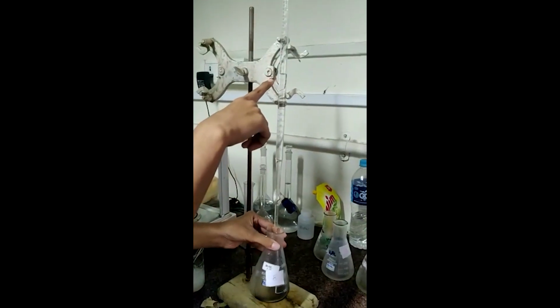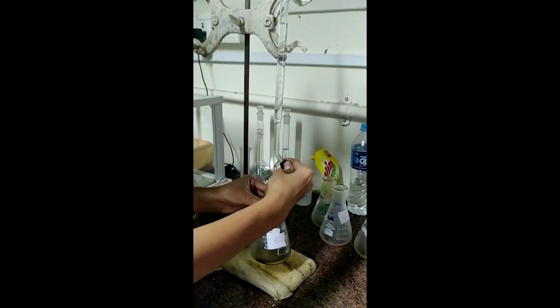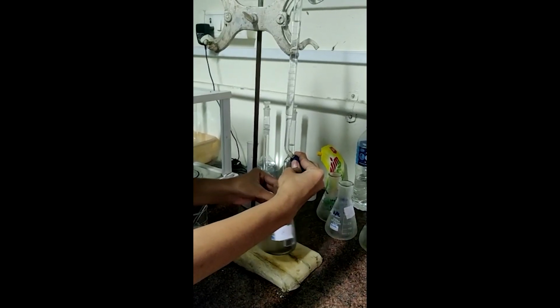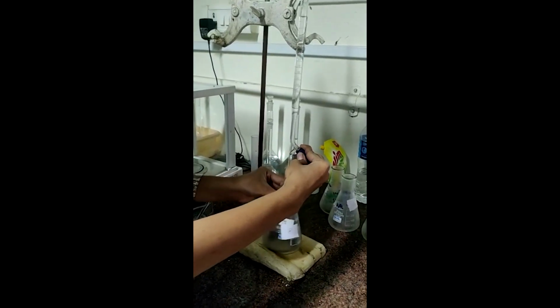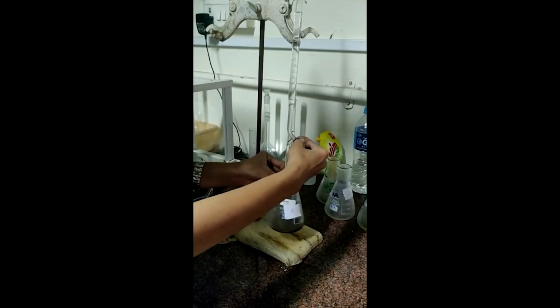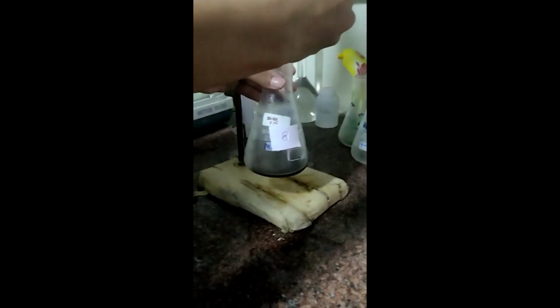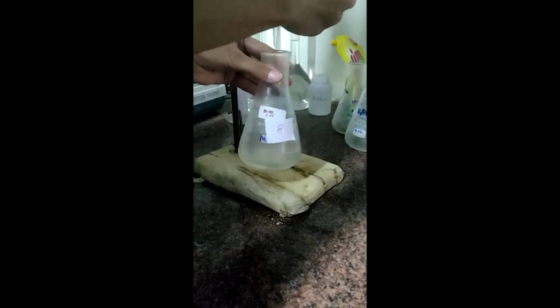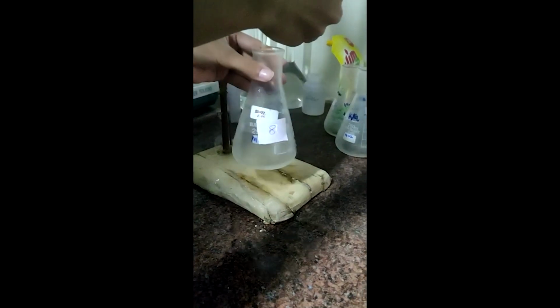Now we will titrate it with sodium thiosulfate. The initial reading was already taken. We will titrate until it turns colorless. It has turned colorless, and so then we can obtain the results from the volume consumed.